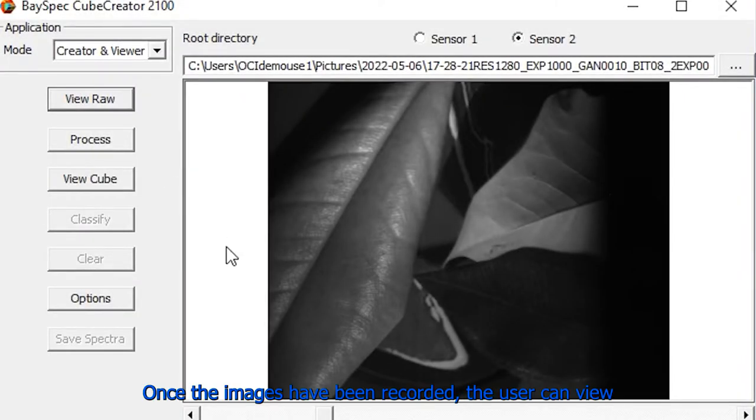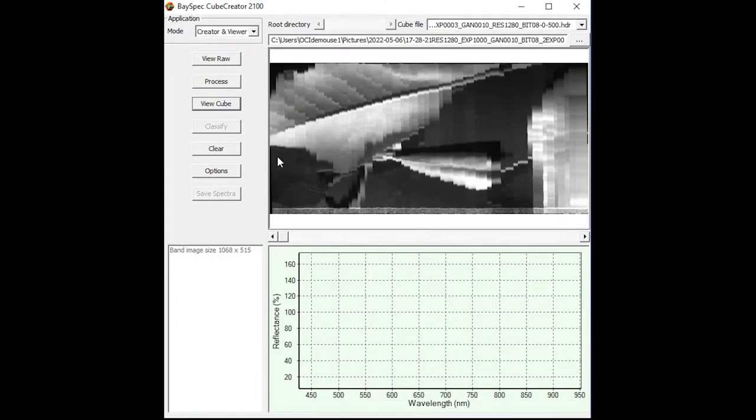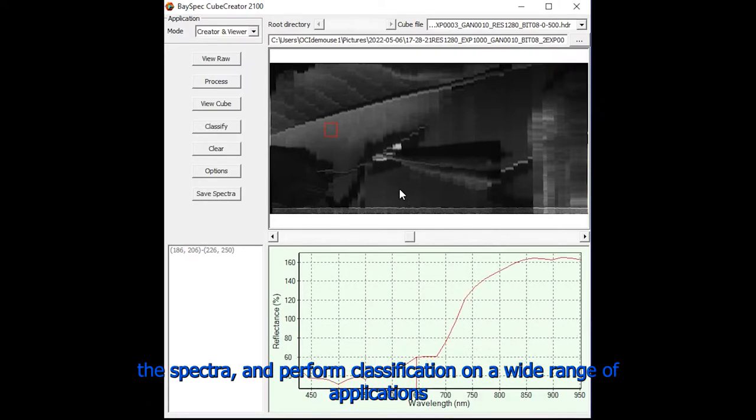Once the images have been recorded, the user can view the raw images and analyze the hyperspectral cube. From the hyperspectral cube, the user can select areas to view the spectra and perform classification on a wide range of applications.